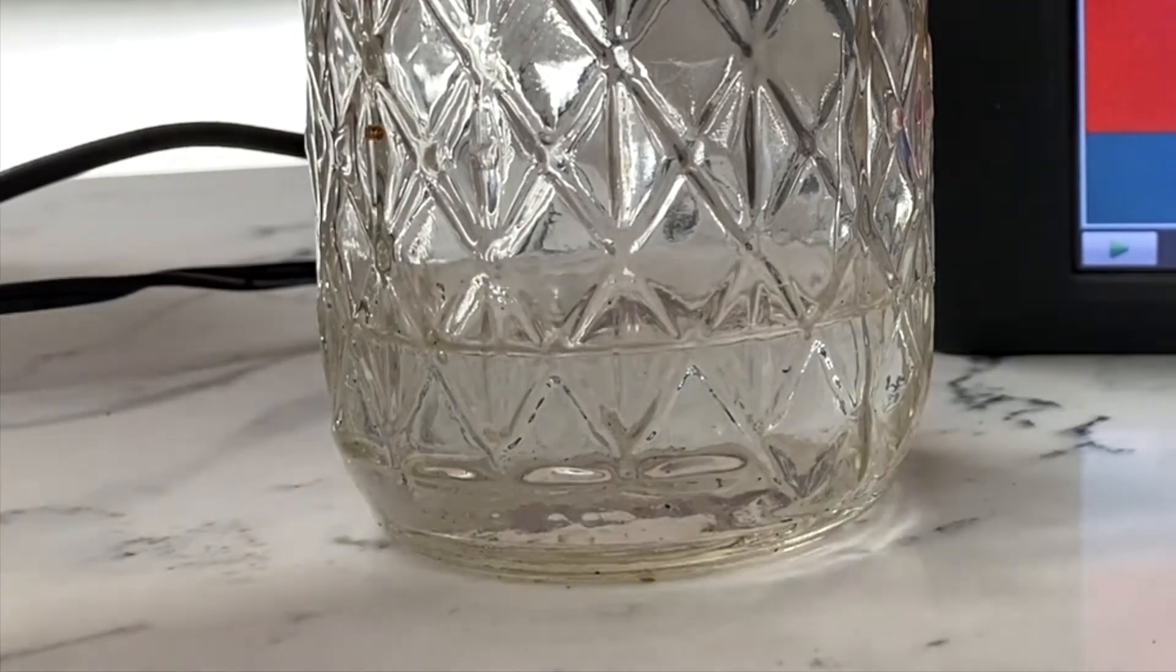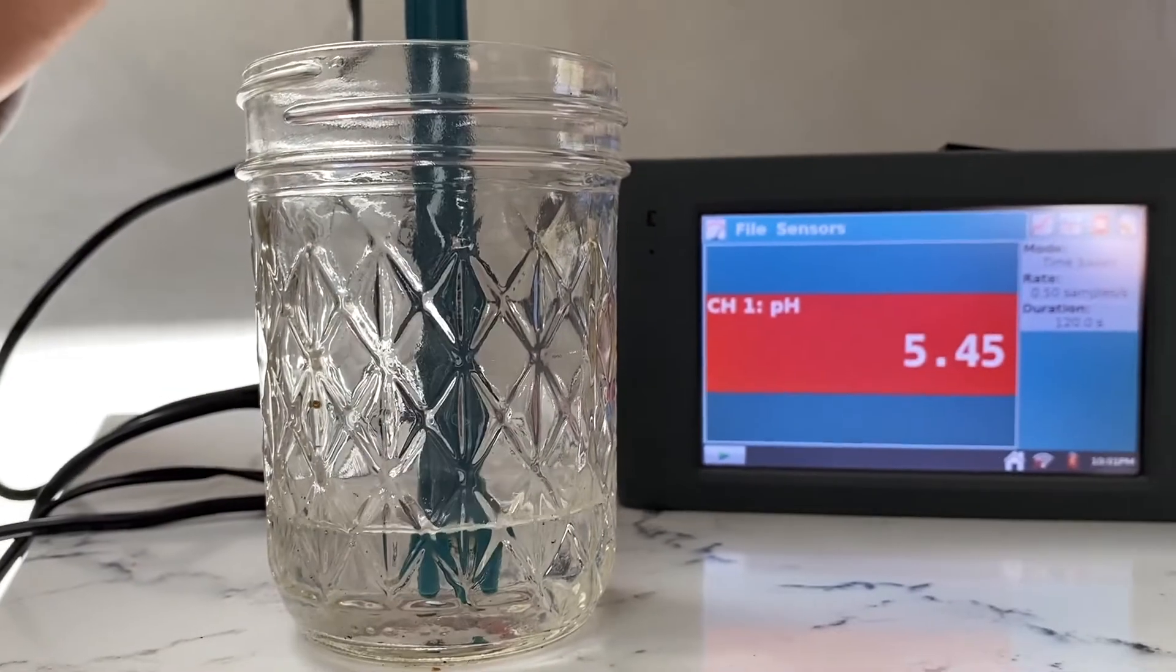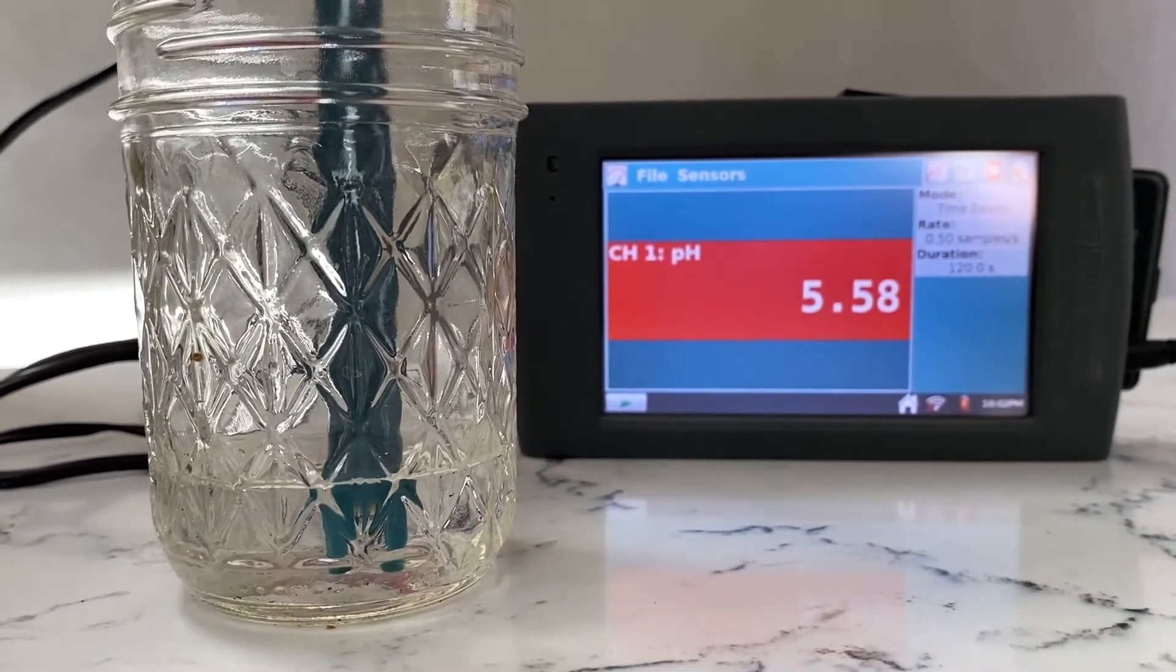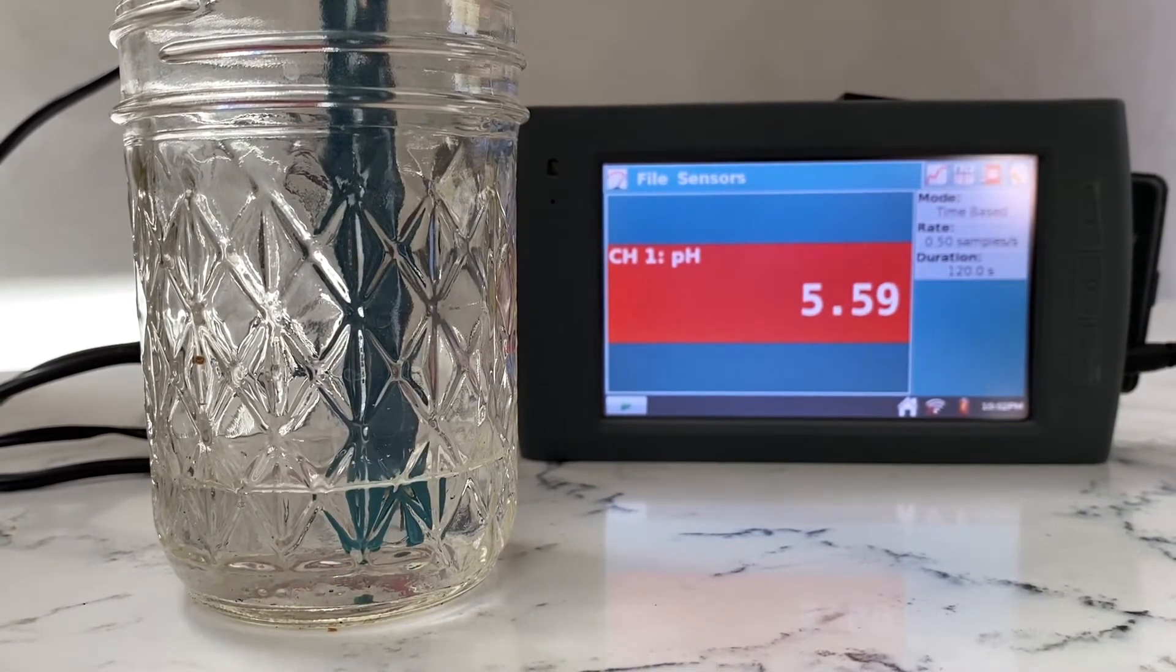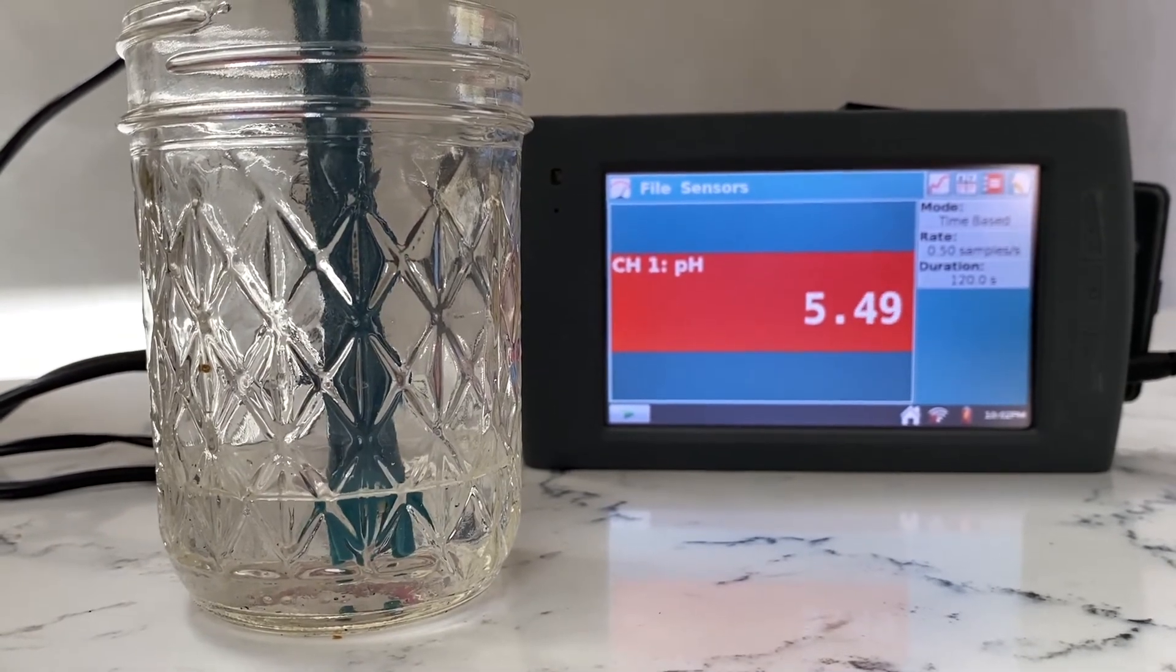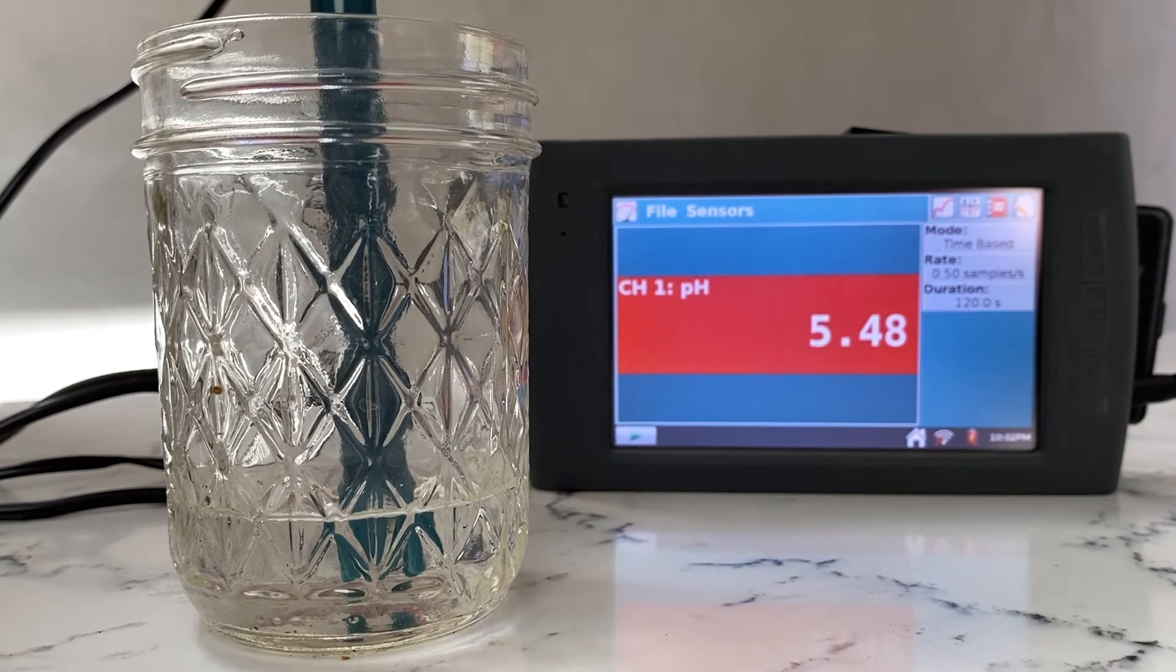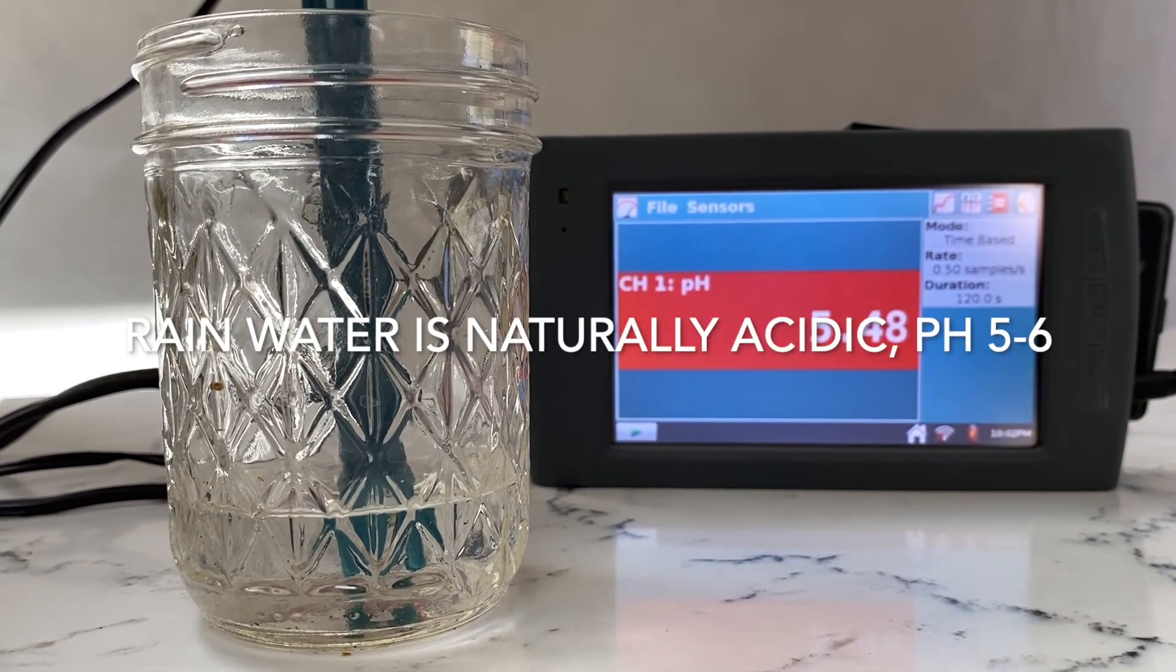I collected some rainwater when it rained last week. Let's wait for this to equilibrate. This is the pH of rainwater collected in Los Angeles in the week of April 10th. Let's see what we get. So this is not a pH of seven—basically between a pH of five and six. Rainwater is naturally acidic.